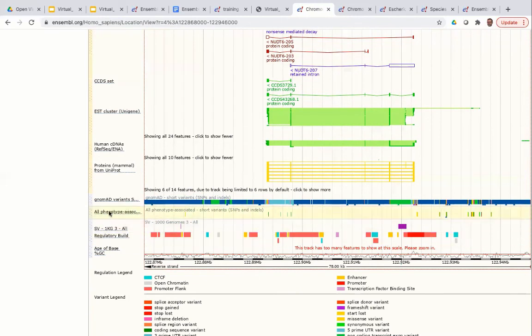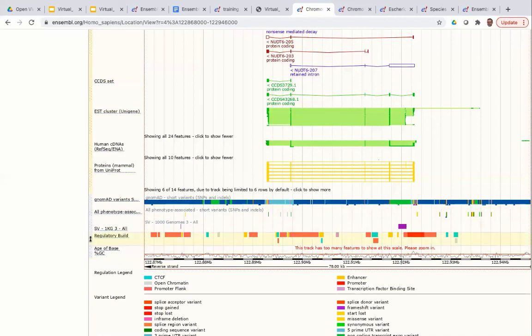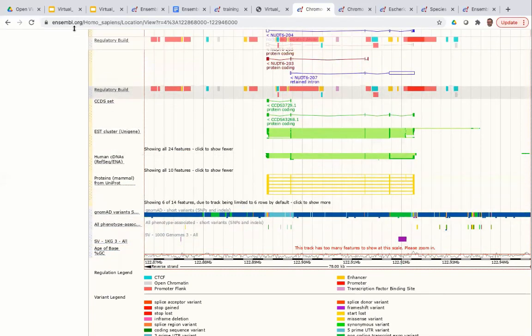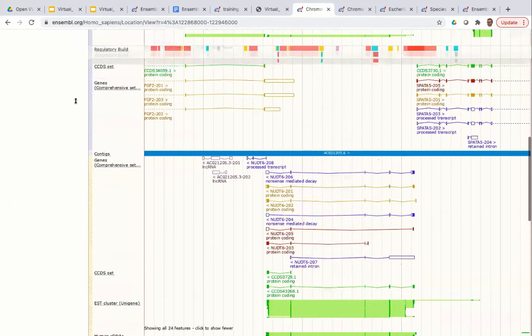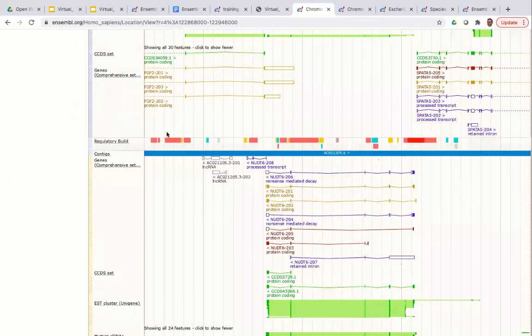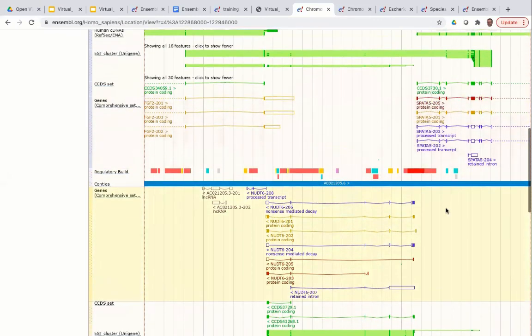If you want to reorder tracks, hover your mouse over the track until it turns into a double-headed arrow, then click and drag it further up the page. For example, dragging the regulatory build track up lets you see regulatory features in the context of the forward strand genes.